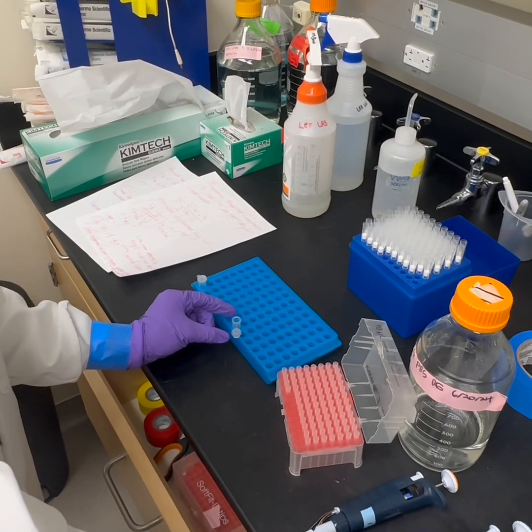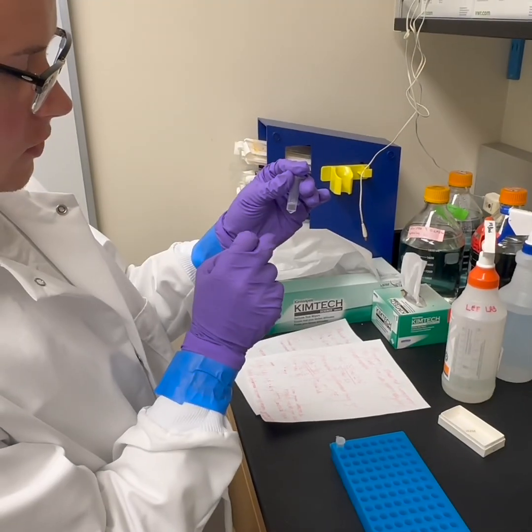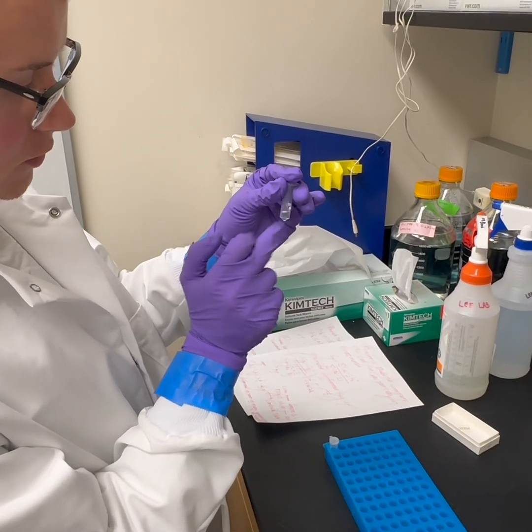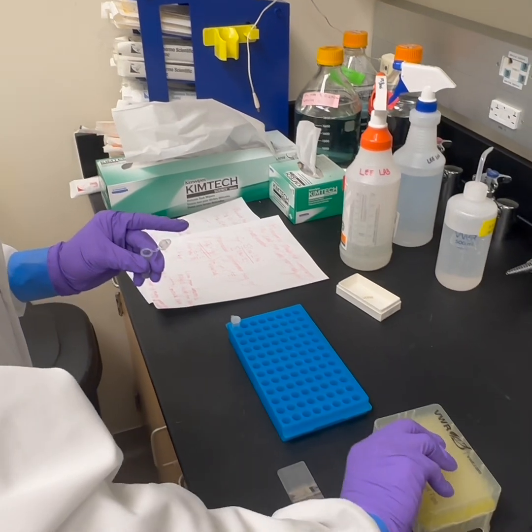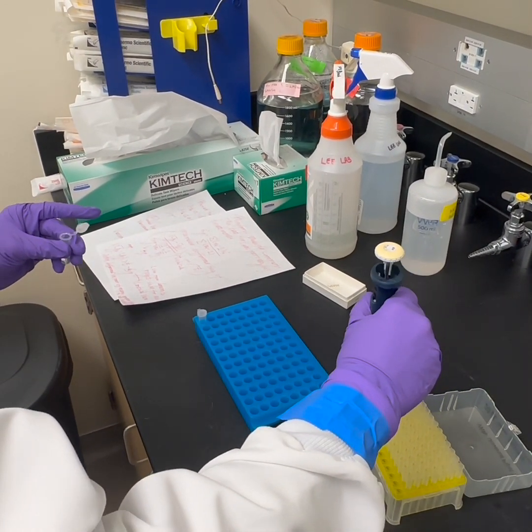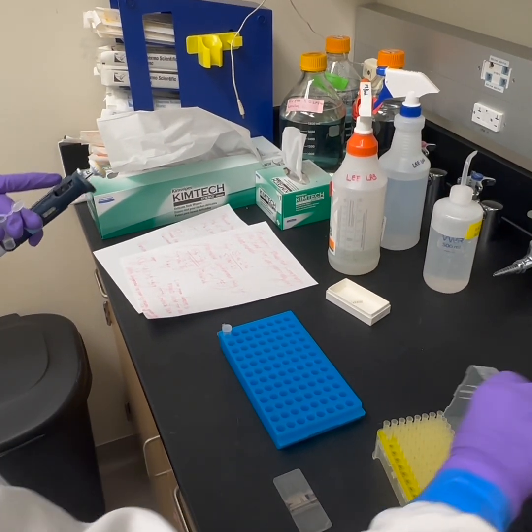Okay, now I'm going to grab the hemocytometer. Before I add this to the hemocytometer, just going to make sure it's mixed really well. I'm going to add 10 microliters to each side.